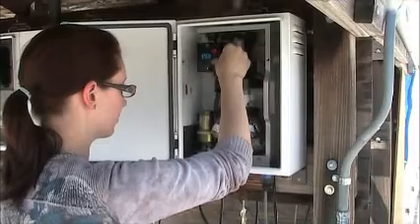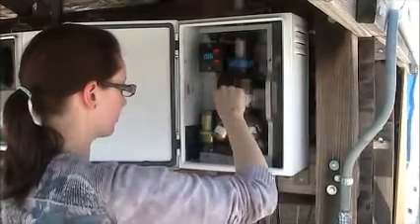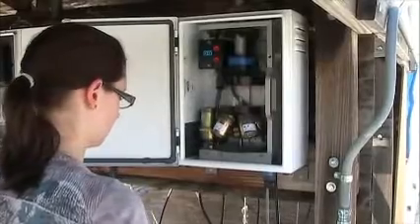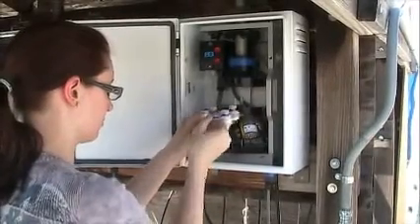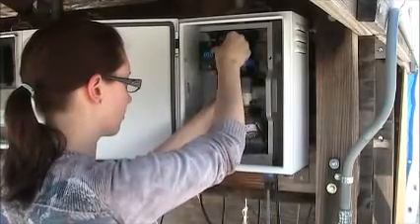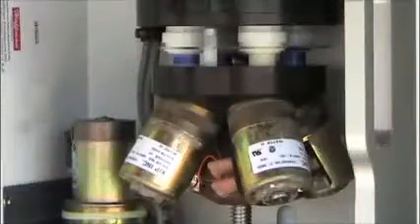Uninstall the week 1 cartridges, place red caps over the cartridges, and return them to the week 1 bag. Insert the week 2 cartridges, making sure to orient the D cartridge properly. Week 2 cartridges will have 3 filters in each, so you will take 3 readings for each module. Make sure that the controller is at the default screen before leaving the site. This completes the week 2 sample change.